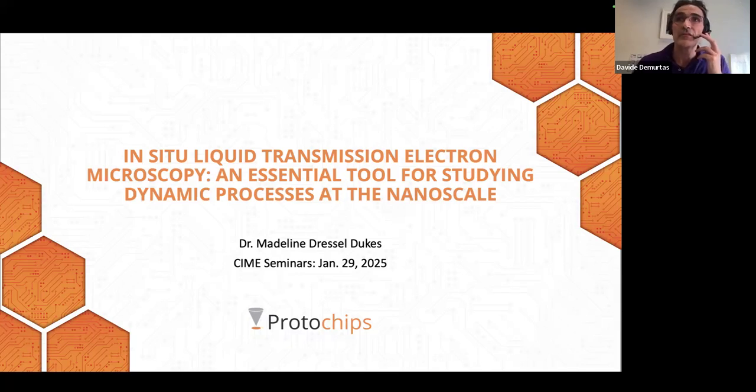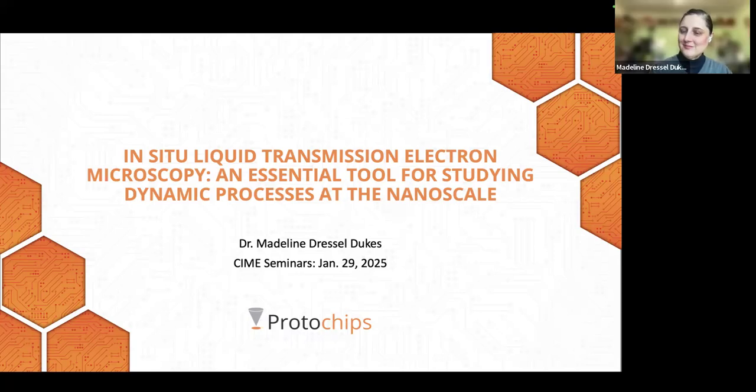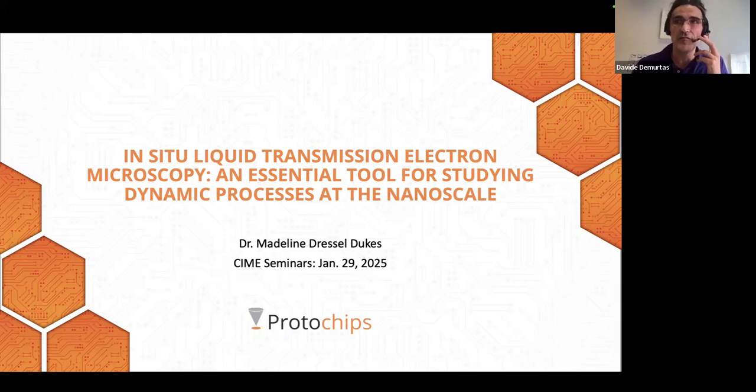Her dissertation, Scanning Transmission Electron Microscopy of Target Proteins in Whole Eukaryotic Cells, was supervised by one of the founders of liquid phase TEM, Dr. Niels de Jonge. She utilized the first prototype of the in situ liquid TEM system, called Poseidon.